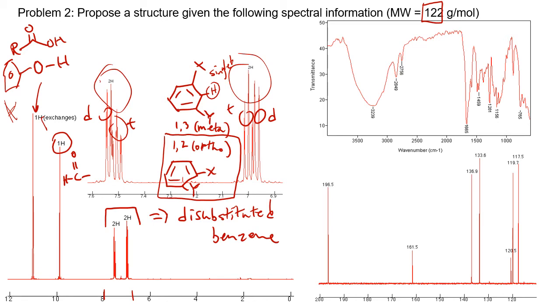Let's look at the rest of the information we have. If you look at the IR spectrum to the right here, we see that we've got something around 1665. This confirms our observation that we have an aldehyde at least. We notice a big OH peak around 3300. This is really suggestive that we have an alcohol. And so from the IR, it's pretty consistent. Also notice these two peaks here at 2756, 2849. Those are a clue. We'll come back to that before we finish here.